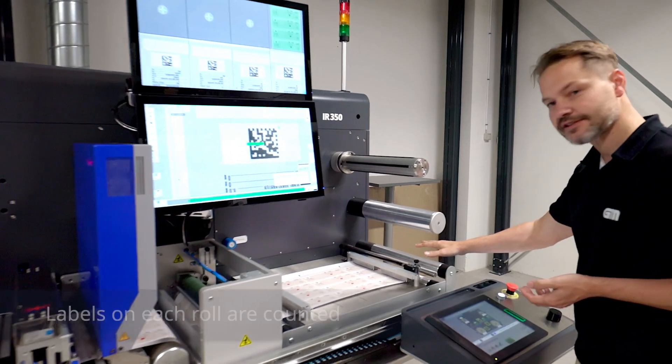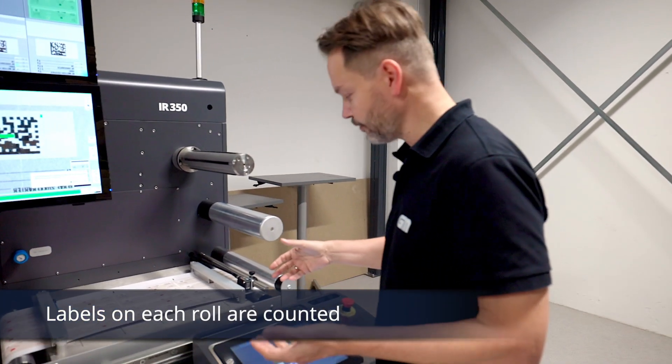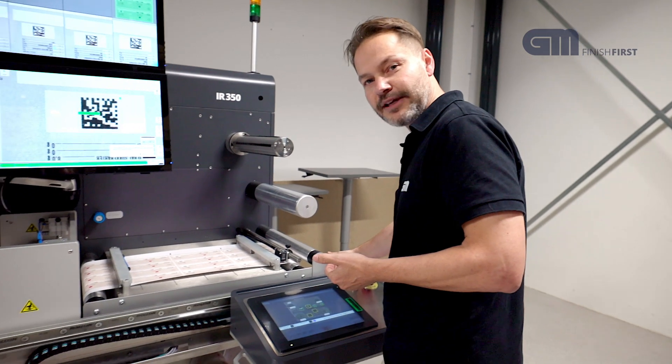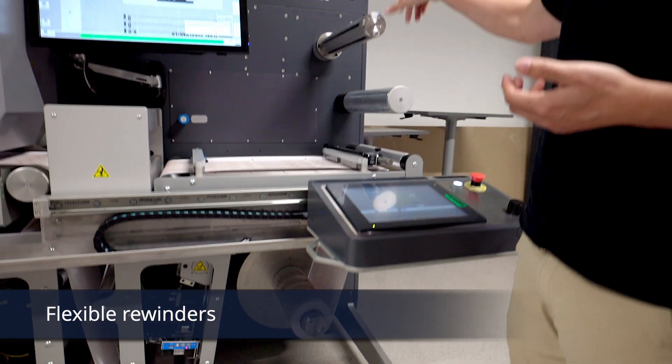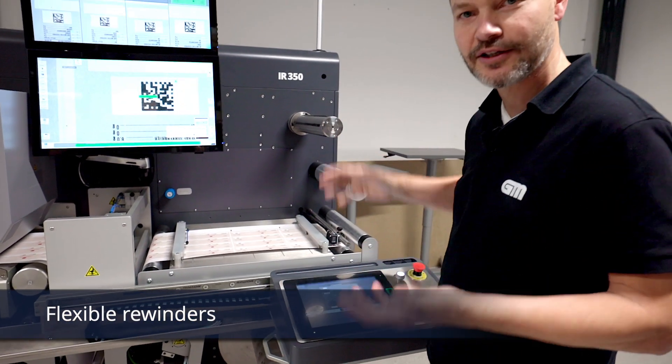Finally, there is a count, so we can count how many labels are on the roll. The roll ends up down here where we have a rewind on the machine. For ease of access, you can also use the upper rewind on the machine depending on the roll weight.